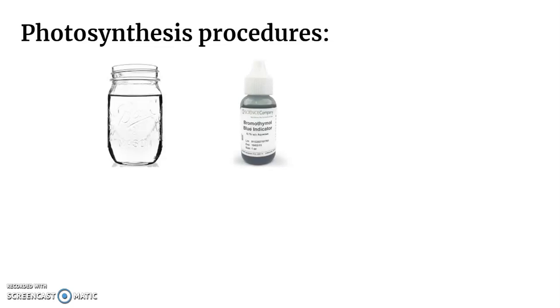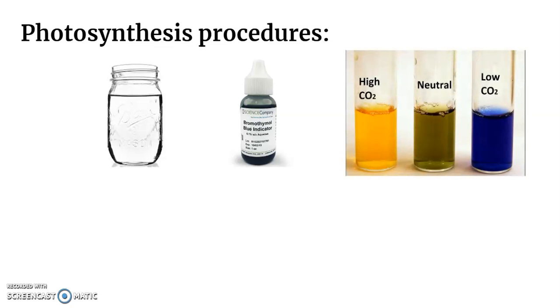These are the steps for this lab. First is to fill a jar about 4/5 full of water. Add 12 drops of bromothymol blue in this jar. Using a straw, blow gently into the jar number 1 for 1 minute. In a day or two, the mixture in the jar should change colors. Allow the color to change without altering the amount of water or the bromothymol blue indicator.